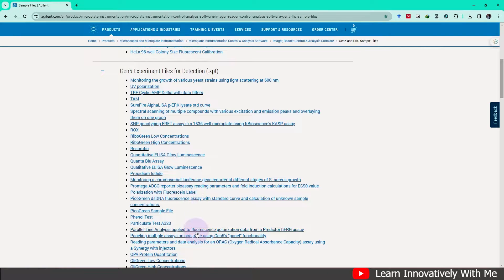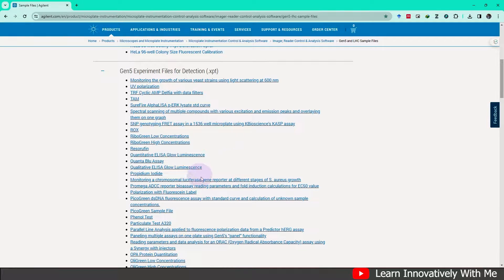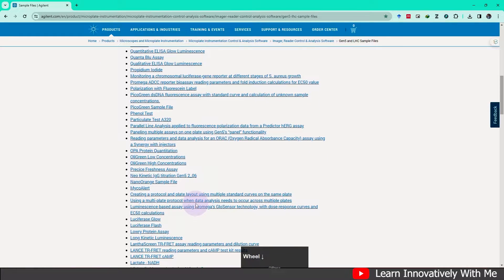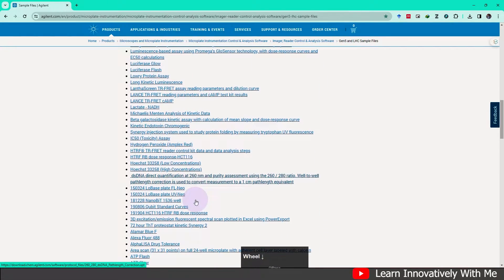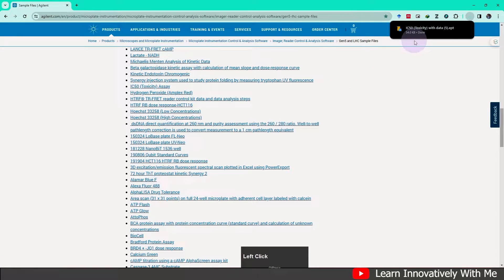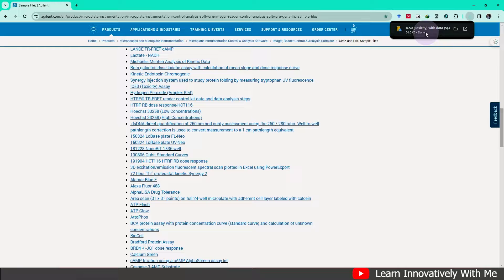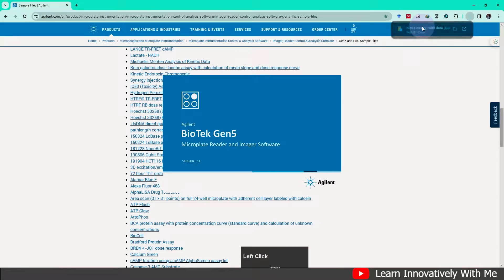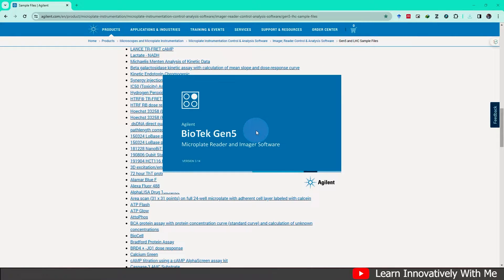You can select a file, download it, and check how they set up the experiment and what are the conditions for data analysis with respect to the experiment. For the IC50 toxicity assay, click here and the experiment file will be downloaded. Click here to open the file.